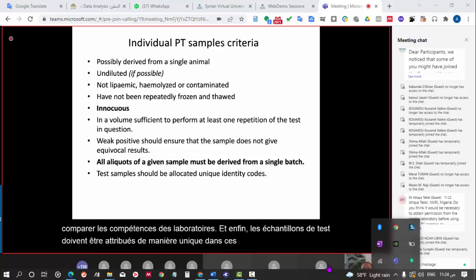So all must be clearly marked, and each participant must know what sample is what, and later on in your report you will recall the number of the samples when giving an explanation of the result.